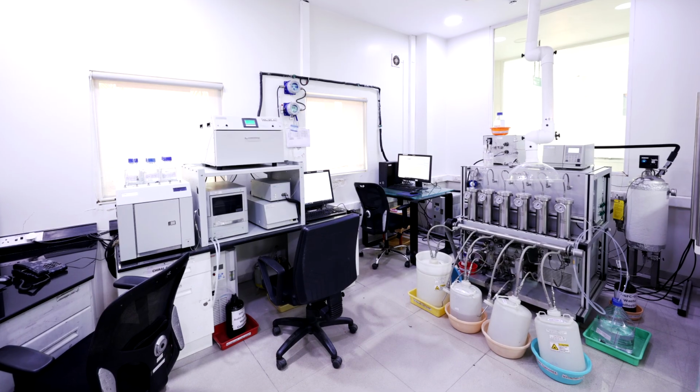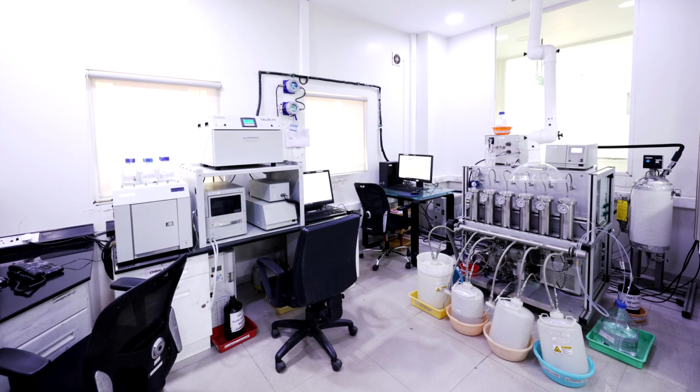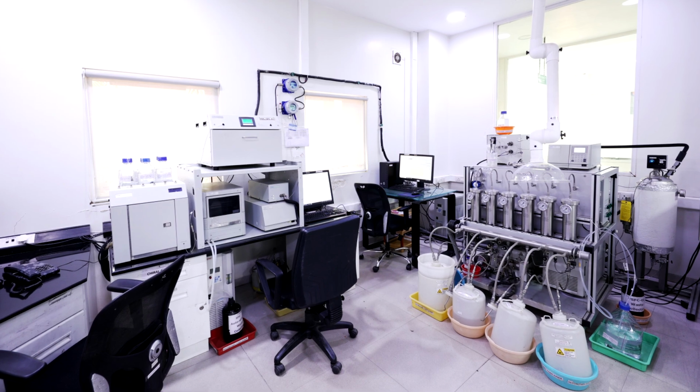Chromatography is still relevant in the pharmaceutical industry for fast-paced programs that are moving quickly through to the clinic. In some cases, chemistries can't be optimized and chromatography is necessary to remove impurities that are produced or recover materials that are obtained in a very low yield.